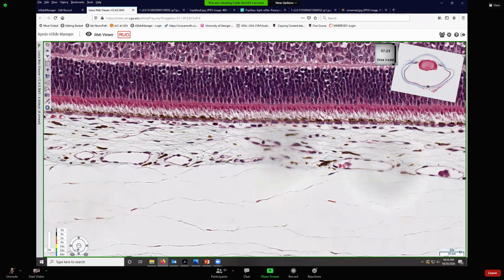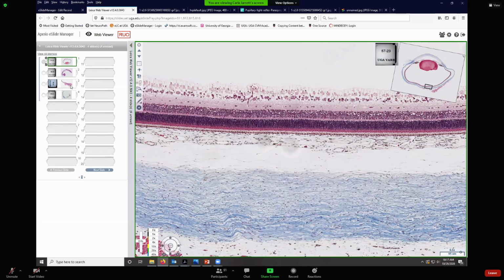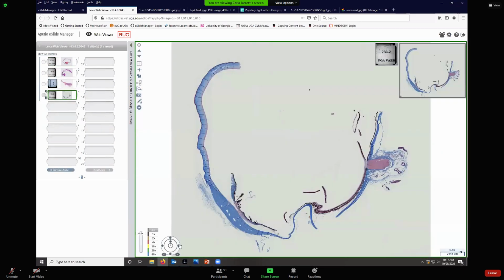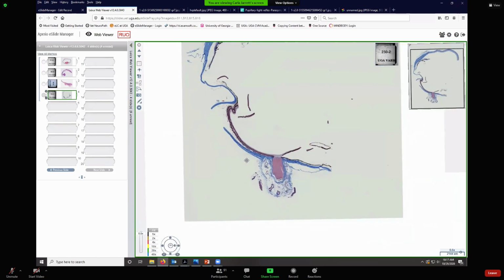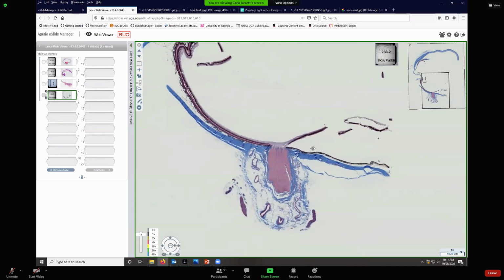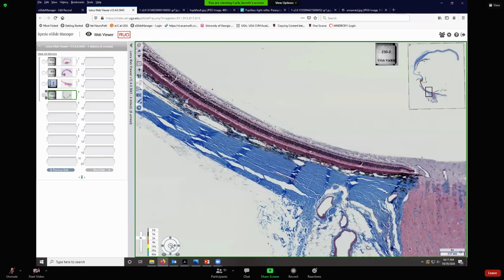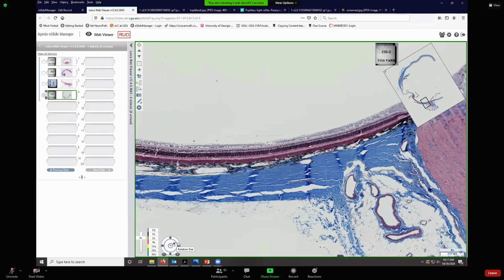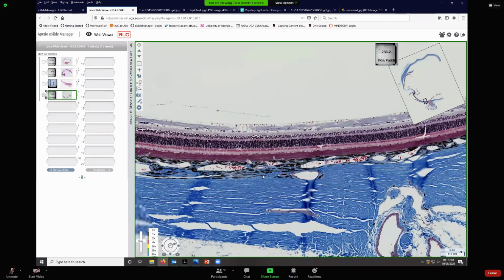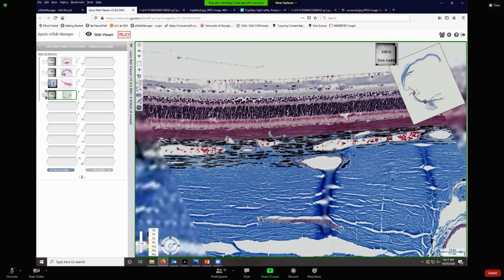So what about this tapetum thing? Well, what does it do? Well, it reflects light. It gives species that have that tapetum a second chance to excite the photoreceptor pigments in the photoreceptor cells of the retina. Now, this is a carnivore, and carnivores have what is called a cellular tapetum. So there are 2 types of tapeta. One is cellular and one is fibrous. And this is a carnivore.